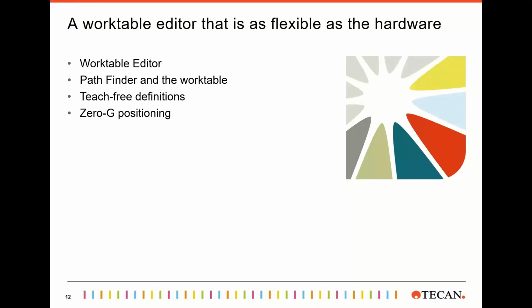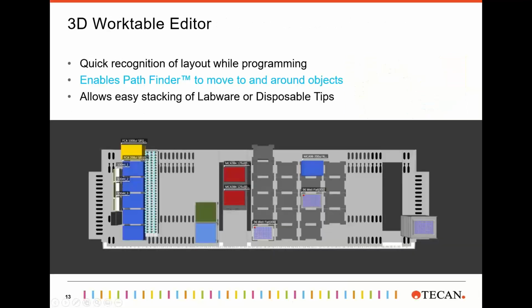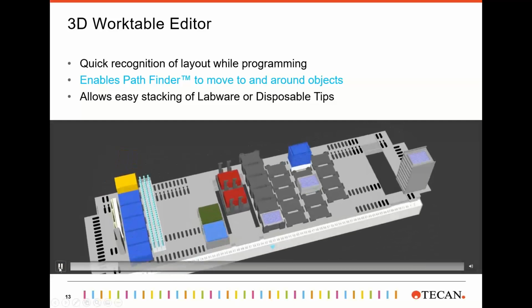Okay, so let's move on to Fluent Control itself, so no longer the touchscreen. We have, first of all, a work table editor that is really, really flexible. Let me just show you here on the next slide. This is the work table editor, and it's in 3D. I can play this and you can see it's in 3D.